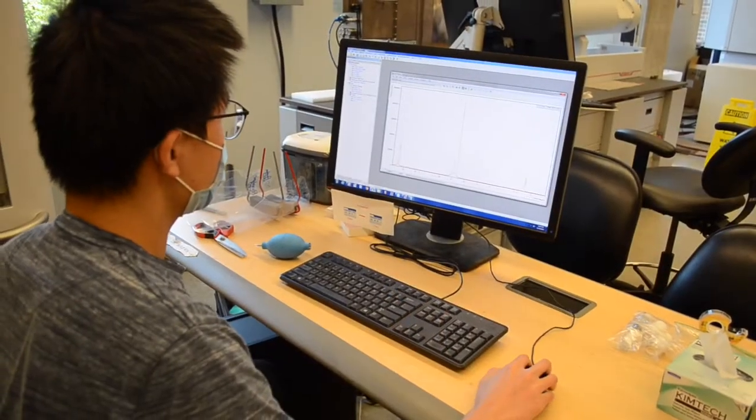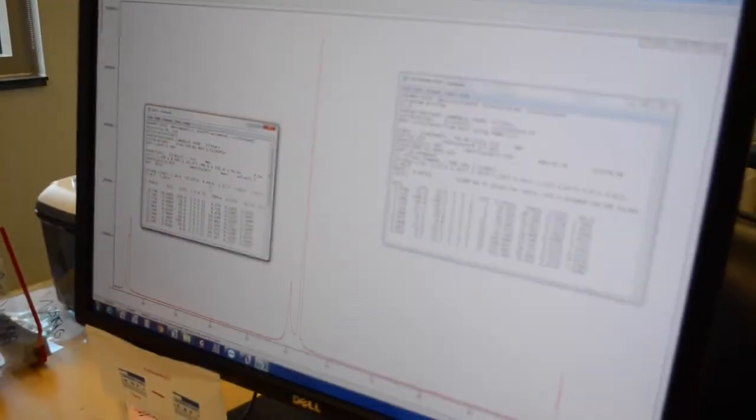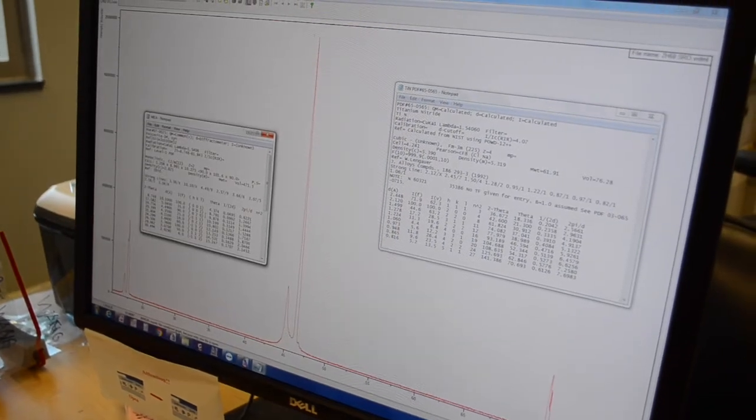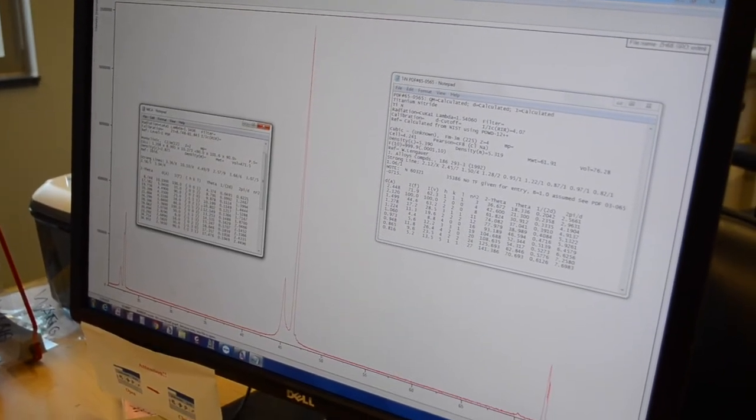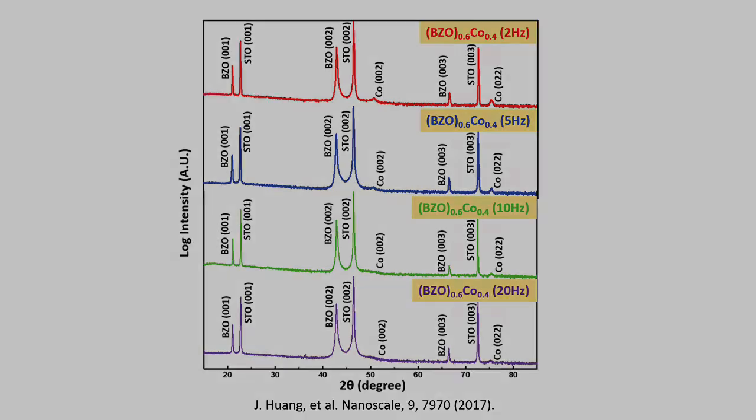We can perform high-resolution XRD theta-two-theta scan after we carefully align the sample's height, theta, omega, chi, and phi. From this XRD spectrum, we are able to identify and quantify the phase information, determine the crystallinity of the film, and measure superlattice in multilayered epitaxial structures.